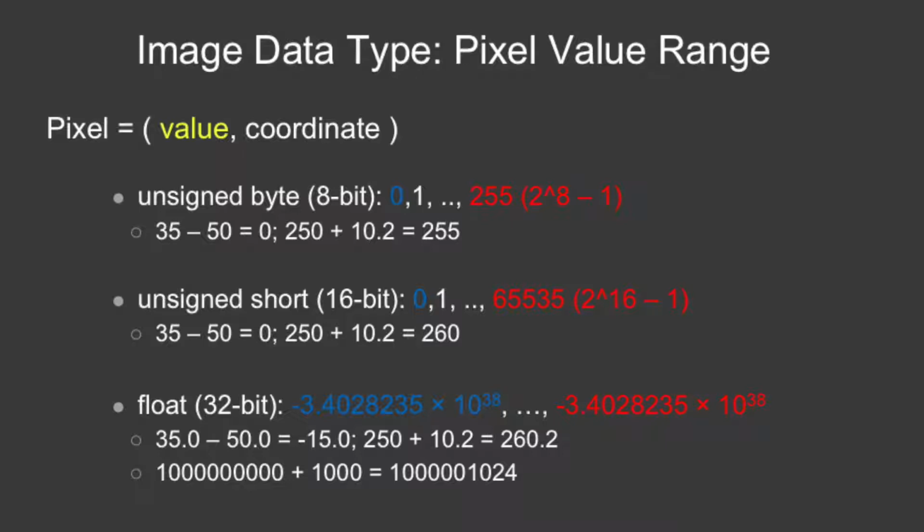So I think, yes, just looking at how many values you have at the extreme of your bit depth is a way to check this image. Okay, good. Just a question related to that slide. There's a question: why is 255 assigned as 2 raised to the power of 8 minus 1?